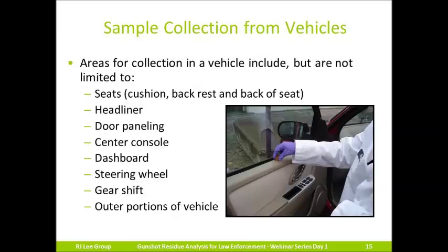Particles are going to tend to adhere better to fabrics than, let's say, vinyl, plastic, or the metal on the outside of a vehicle. If at any time during the investigation of a case you have a question about what areas may or may not be of probative value, please feel free to let us know and give us a call. We can always aid you to determine whether or not collecting samples for GSR is a viable option for you in your particular situation.